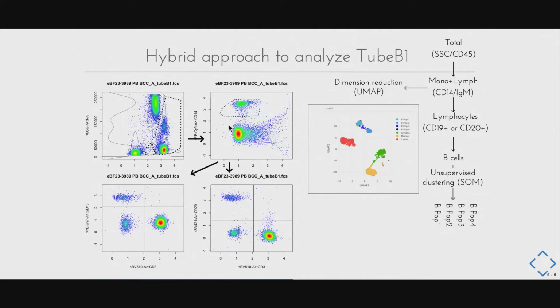First, we use a logical OR gate to label these. We label the cells positive for either CD19 or CD20 as B cells. Then we can apply a clustering algorithm to these B cells to separate potential B cell subsets, as well as separate abnormal cells from normal cells.